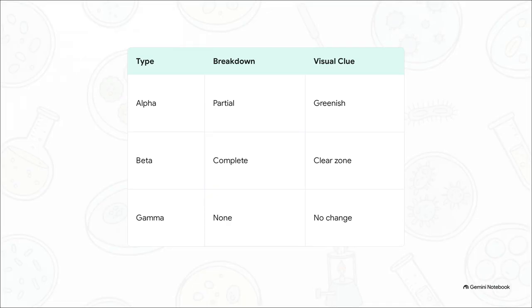Another critical enriched diet is standard blood agar. But here's the cool part. Blood agar doubles as a lie detector. It reveals exactly how a bacterial suspect attacks red blood cells, which is a process called hemolysis. Take a look at the breakdown. Notice how alpha hemolysis is just a partial breakdown? It leaves this distinct greenish discoloration around the colony. Then you have beta hemolysis, which is complete destruction, leaving a stark, completely clear zone around the colony. And gamma hemolysis means no breakdown at all, so the red medium stays perfectly intact. This visual clue is an immediate dead giveaway for our laboratory detectives.